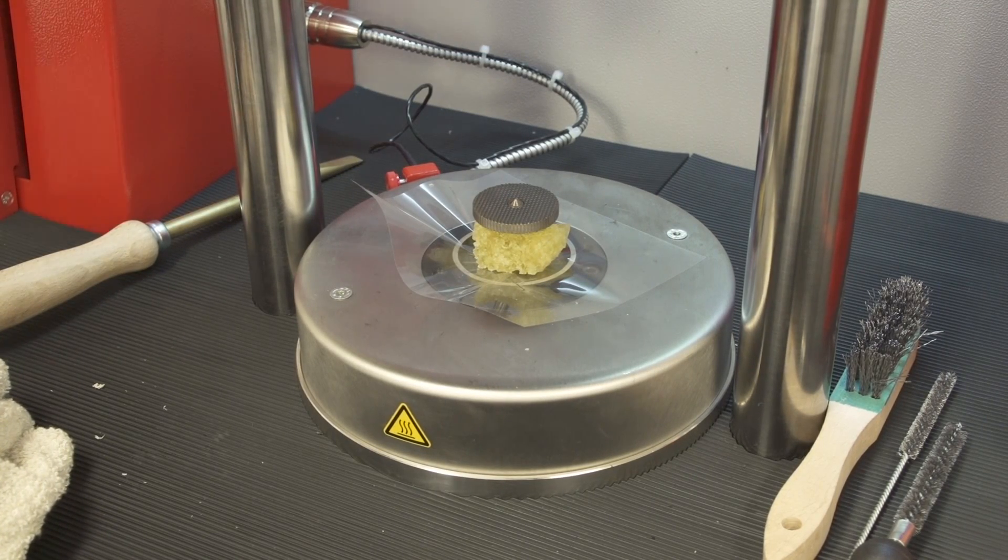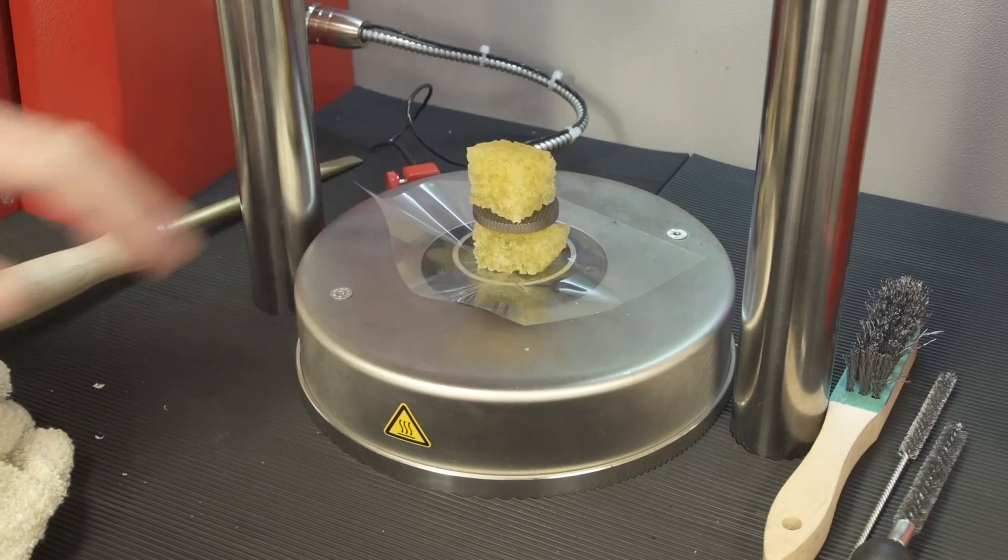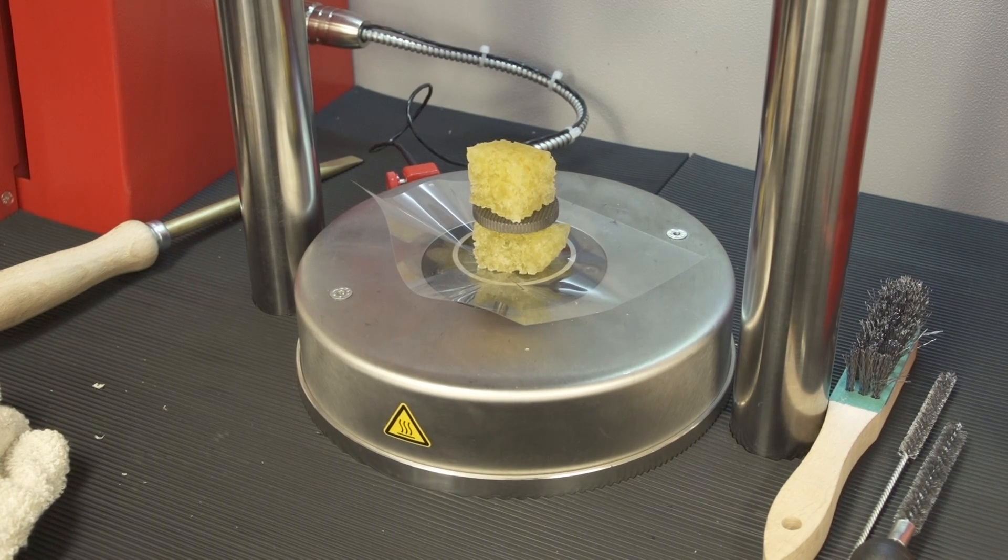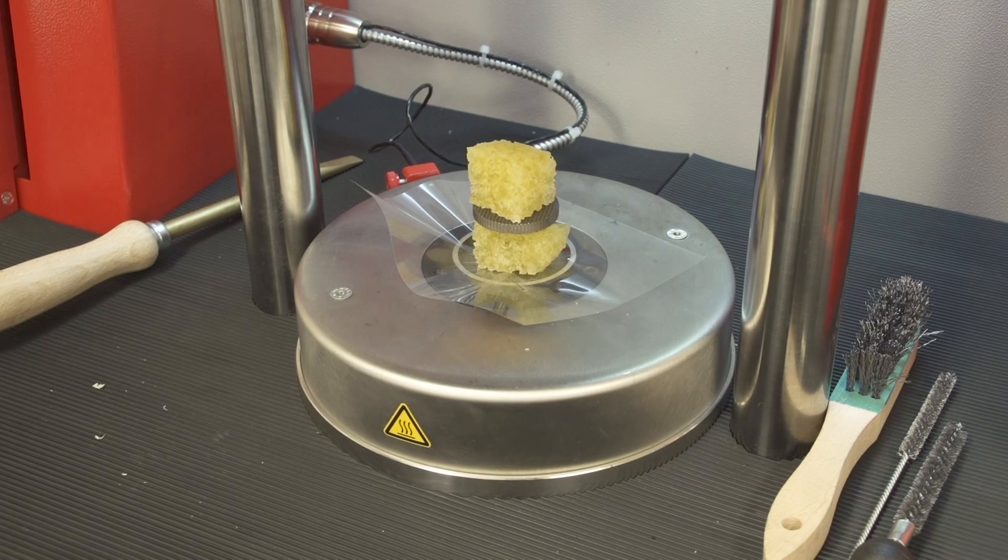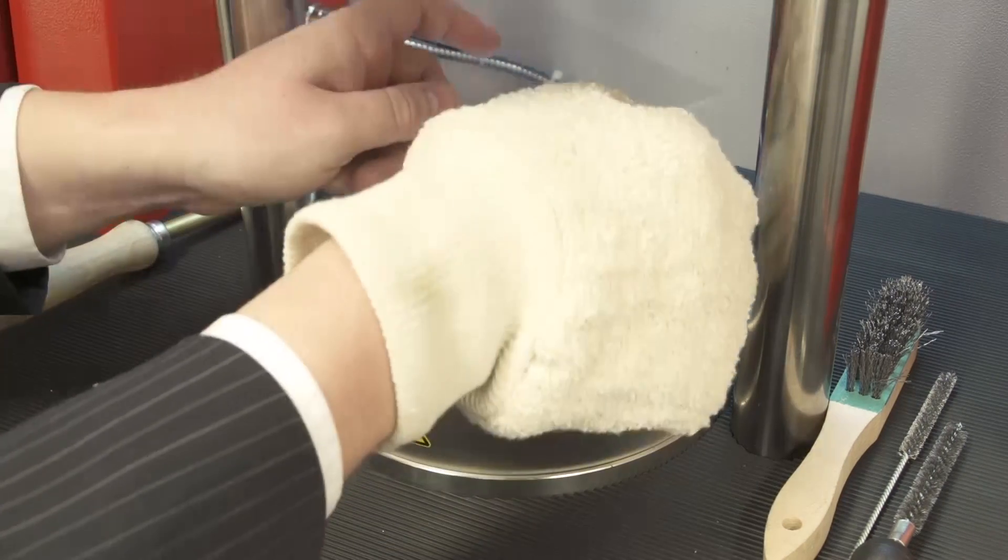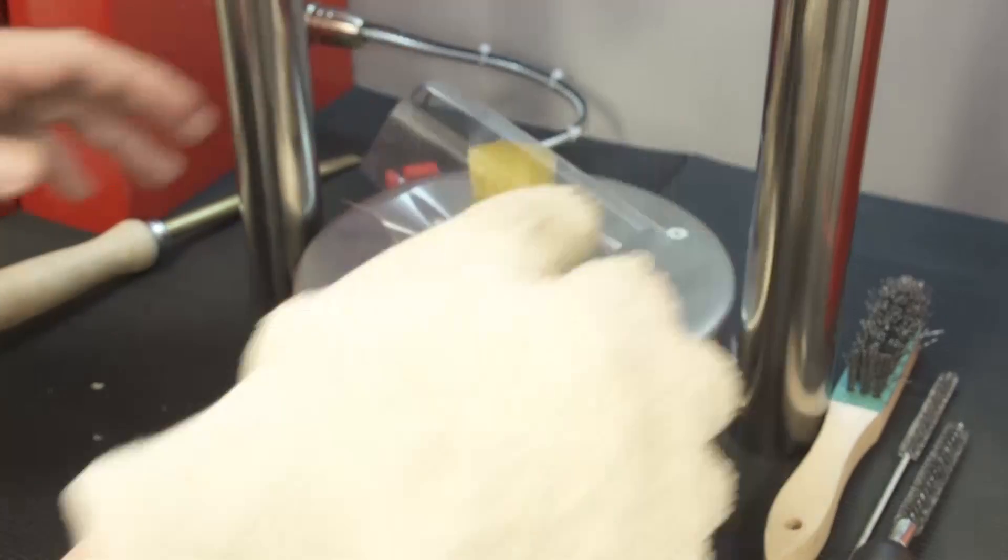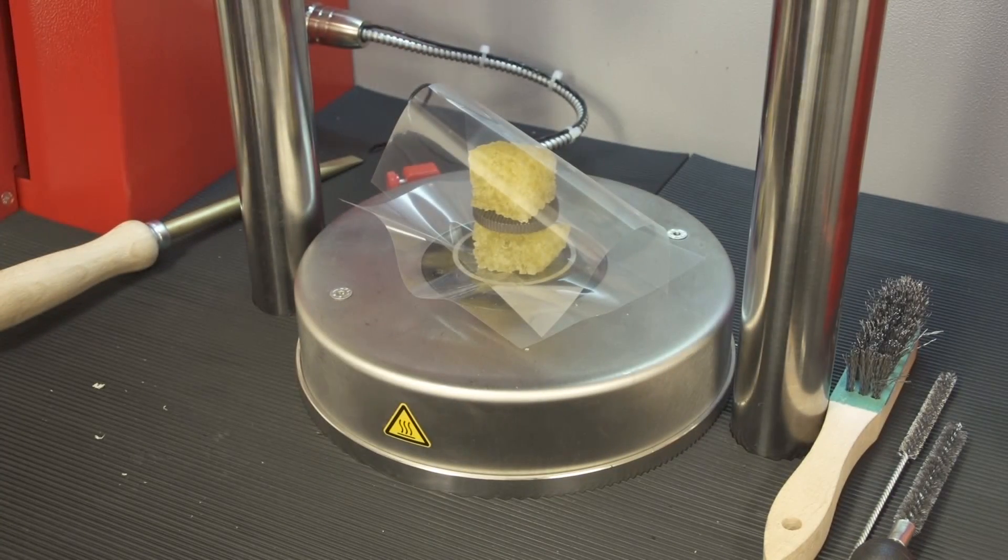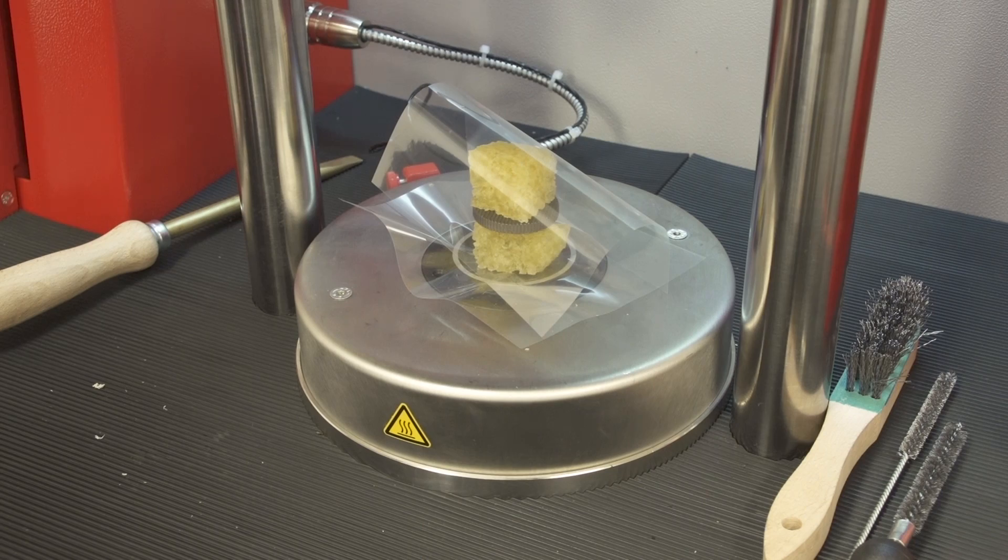Put another sample on top. Both samples together should have a volume of at least 25 cubic centimeters to correctly fill the dies. Put another sheet of testing film on top and then hit the start button on the front of the instrument.